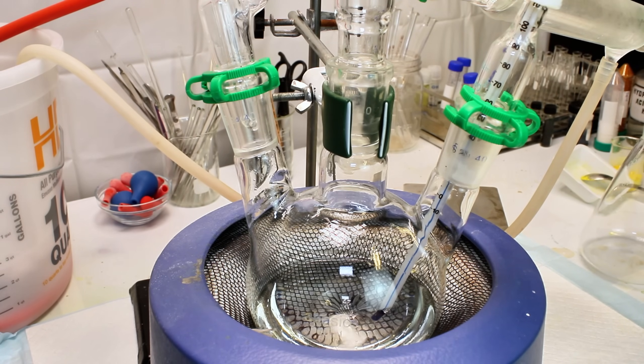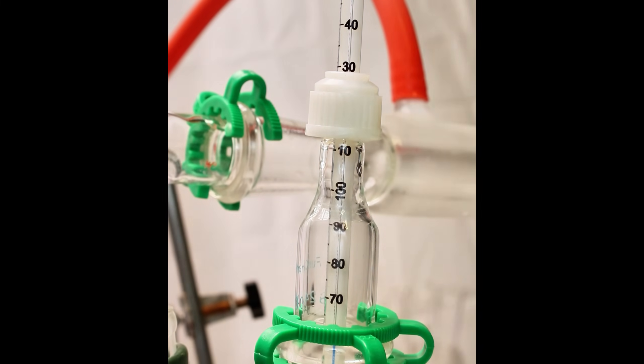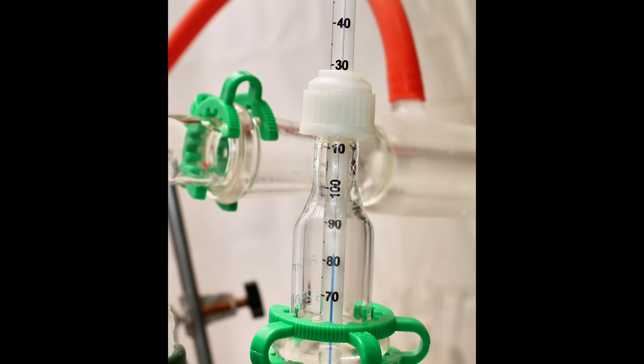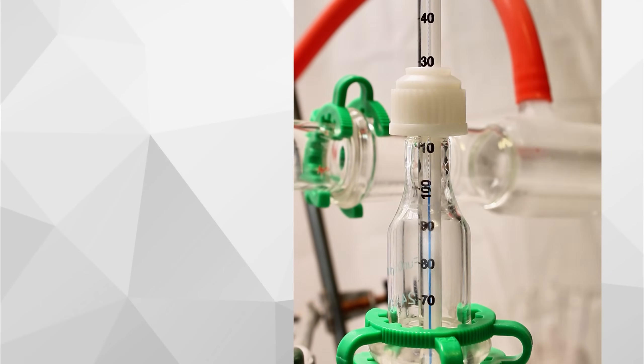Ether has a boiling point of just under 35 degrees Celsius, so almost immediately as it's formed, it will boil away. This ether vapor travels up the distillation head and is condensed back into a liquid, which drips into my collection flask. That's the role of the condenser column. Before I discuss the role of the addition funnel, I need to explain a bit about how this reaction actually works.